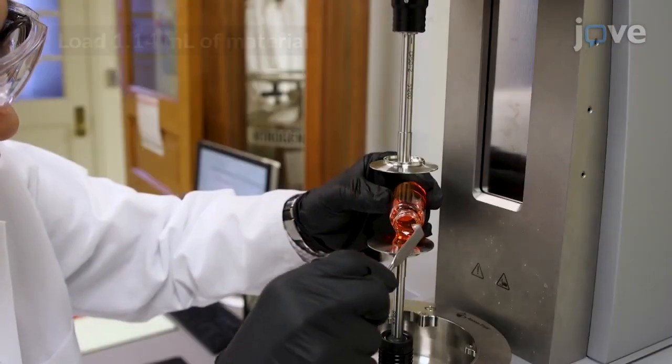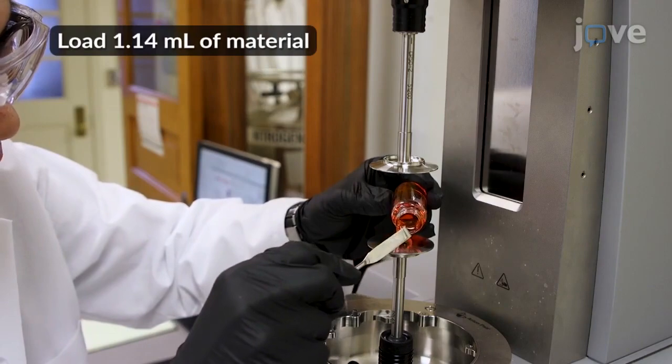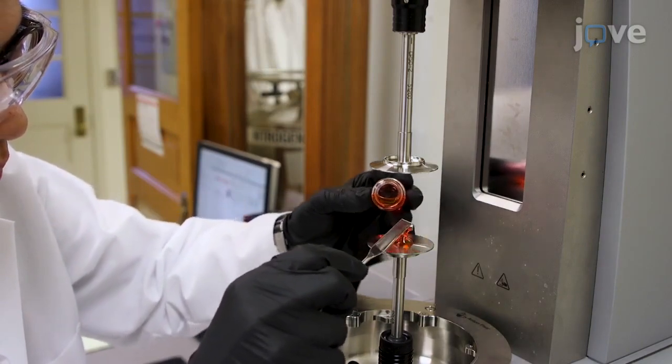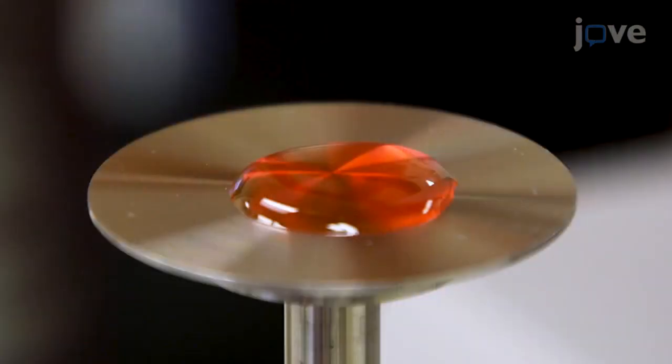With a spatula, load the material onto the top of the bottom geometry. Ensure that no air bubbles are entrained in the sample in the rheometer.